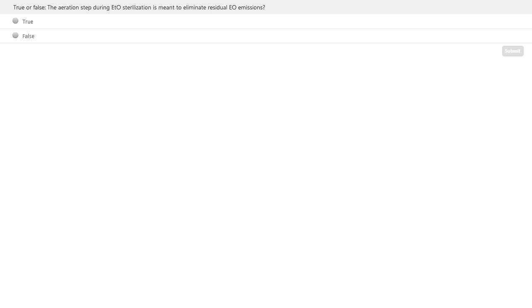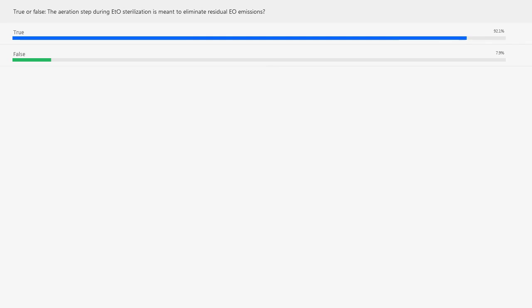All right. The question is, true or false? The aeration step during ETO sterilization is meant to eliminate residual EO emissions. Is that a true or a false statement? And the winner is true. The vast majority of the audience feels that that is a true statement. So that's something you need to take into consideration if you do elect to use chemical sterilization. Not only are the cycle times long, but there's also a post-aeration process. So just something else to take into account when you're trying to choose your sterilization method for your specific application.